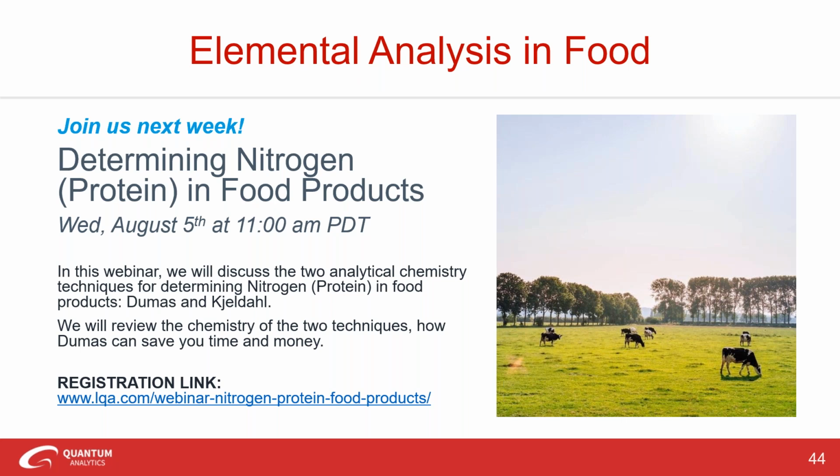So can you show accuracy in comparison to it? Yeah, there are ways that you can do this, where you have a range of samples that you calibrate against, and then you show the precision by doing standard precision tests and repeatability tests. And this can be done in a couple of ways. One way I like to do it is I'll show one sample run 10 different times. And then I'll show 10 different prep samples and run those 10 different times, showing you not only the accuracy of the analysis, but also the precision and reproducibility of the instrument itself. And then you can do some comparative studies. Some of those charts that I was showing you, where they showed good accuracy, that's what we were doing. Those reference materials were analyzed by ICP, or an ICP-OES type of system, and we were again able to show good correlation within a really nice standard deviation.